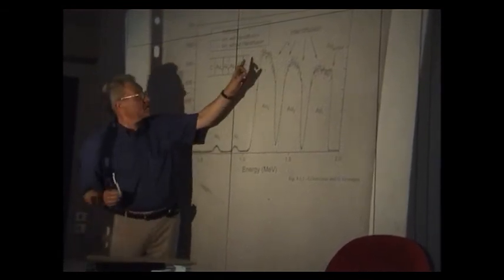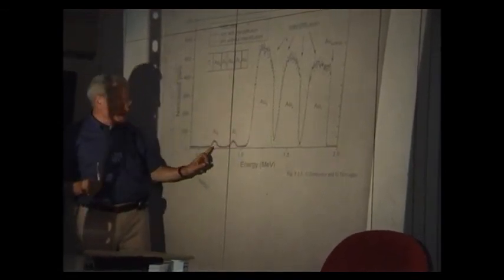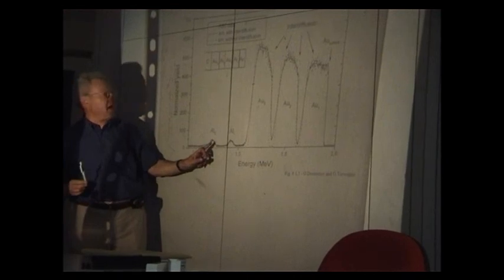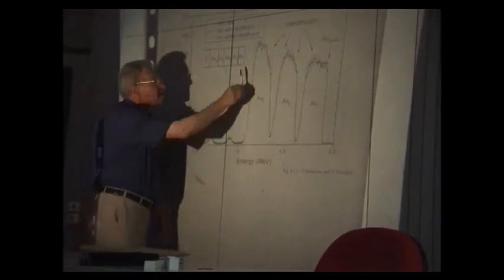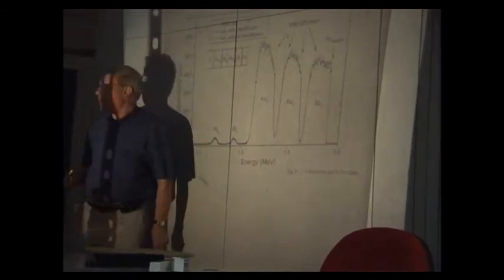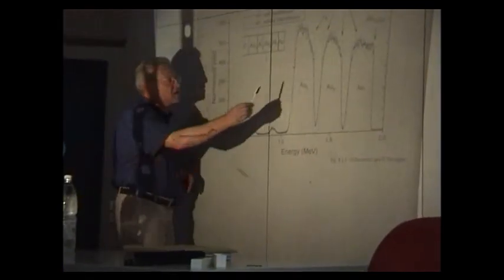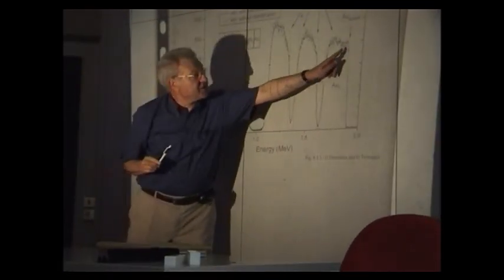For the second gold, we have here the signal. For the second aluminium, the signal is there, and for the third gold, the signal is there. You see that the signals are not squared, but the signals are smooth in the surrounding, except at the surface.